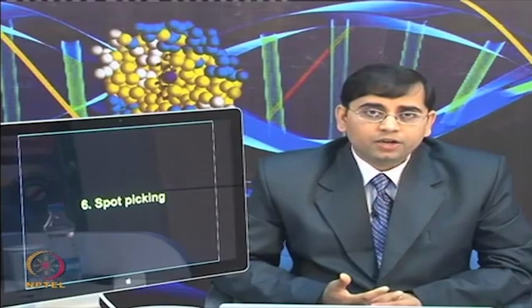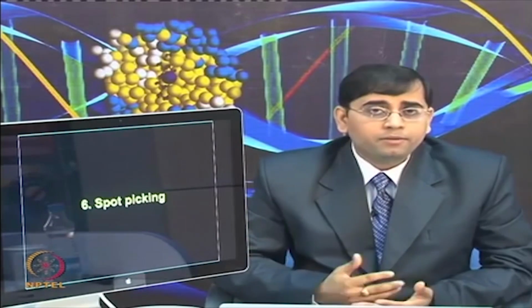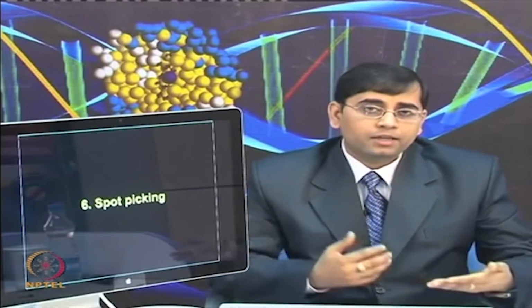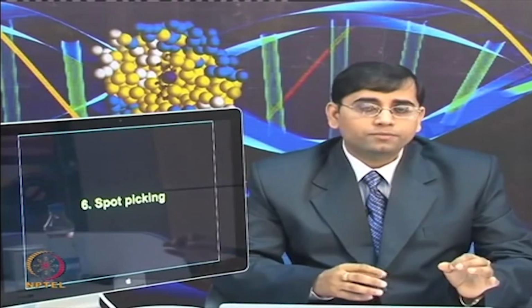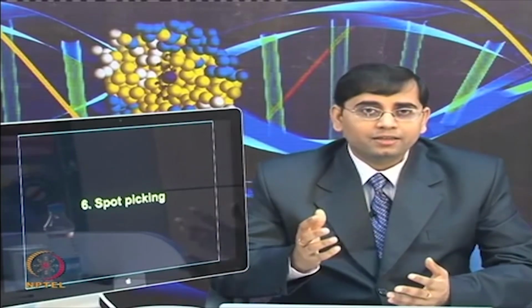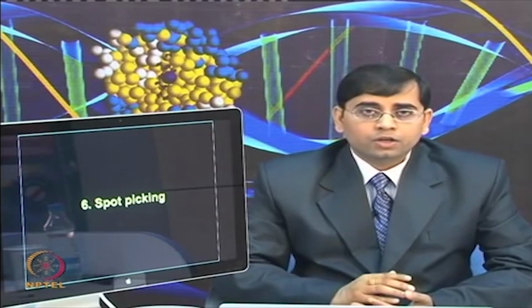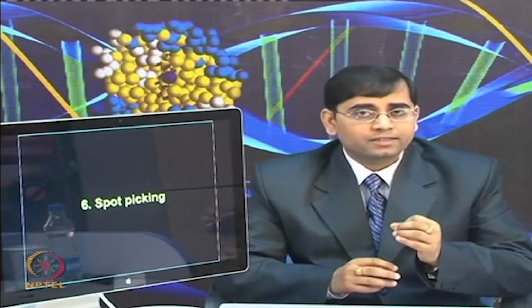So, if you have a small number of protein spots, it is very easy to excise the spots from the gel even manually. If you print the spot map or the 2D gel image and keep it side by side with your gel, it is possible to locate those spots on the gel and excise them manually. You obviously have to ensure various quality control checks to avoid any contamination, but that can be done. The other way is to use a robot picker to excise the spots of interest, which is more precise, but more costly.